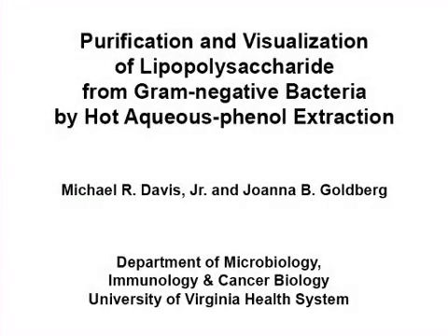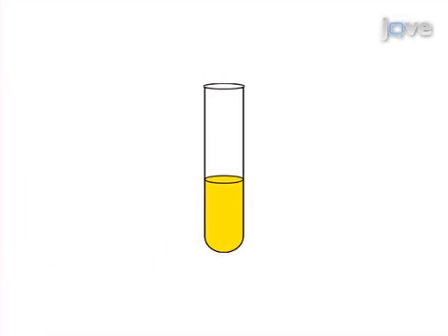The overall goal of this procedure is to extract LPS from gram-negative bacteria. This is accomplished by first growing a 5 mL overnight culture of bacteria in appropriate medium and adjusting the culture to an optical density at 600 nm of 0.5.